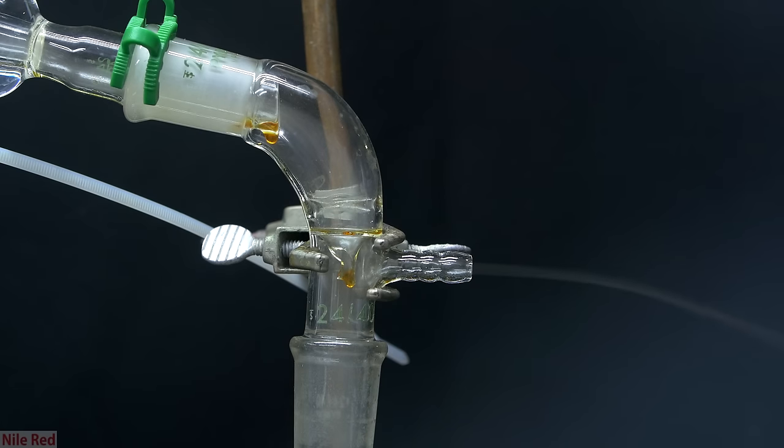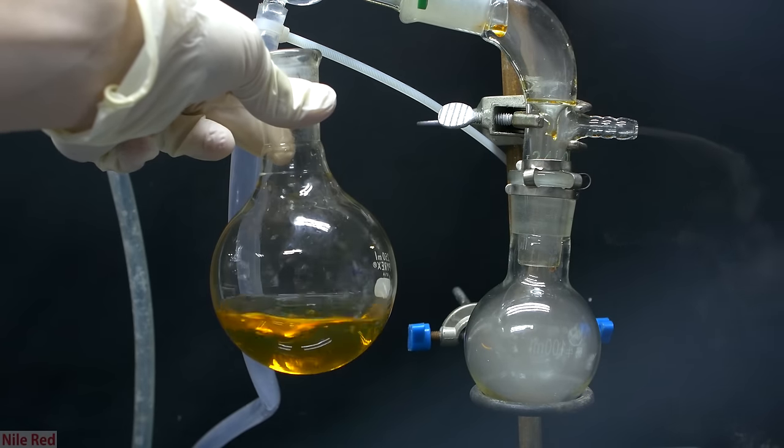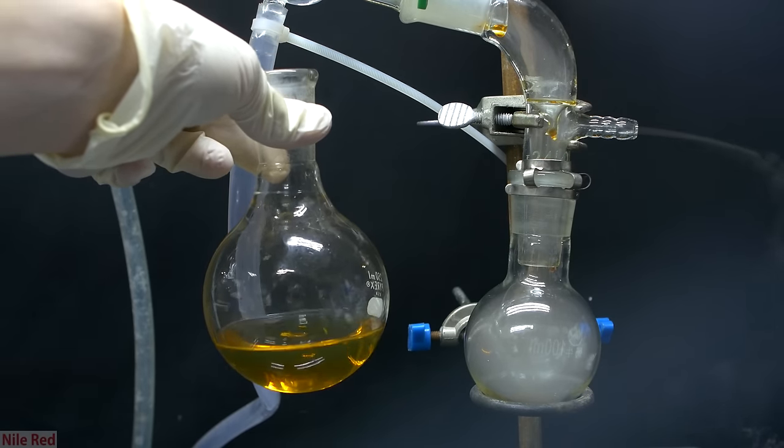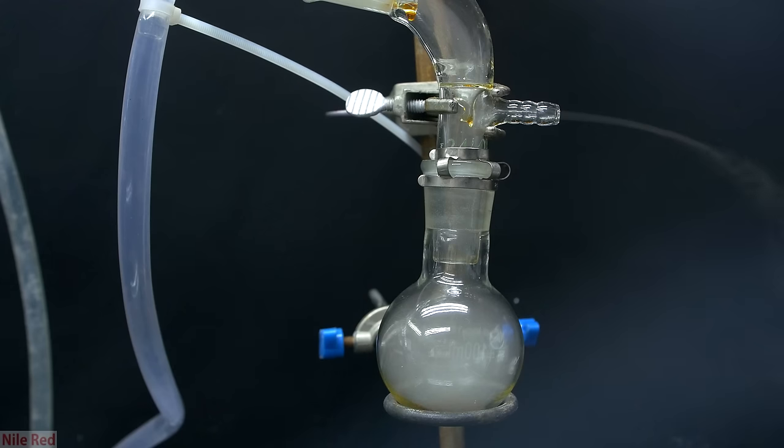Eventually, the distillation slowed down a lot, the distillate became very dark yellow, and a lot of white smoke started coming over. I replaced the receiving flask with a new one to see how much I would collect after this point, and I came to the conclusion that it's not really worth continuing. I let it run until absolutely no more distillate came over, and I think I collected something like a milliliter, so it's kind of a waste of time.